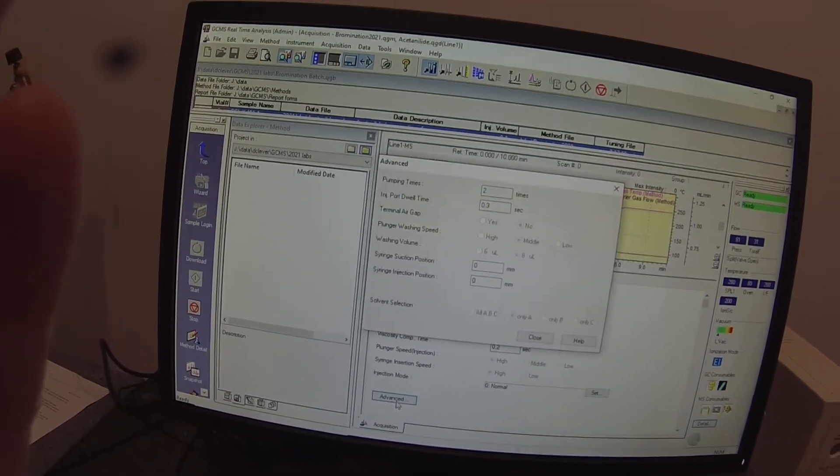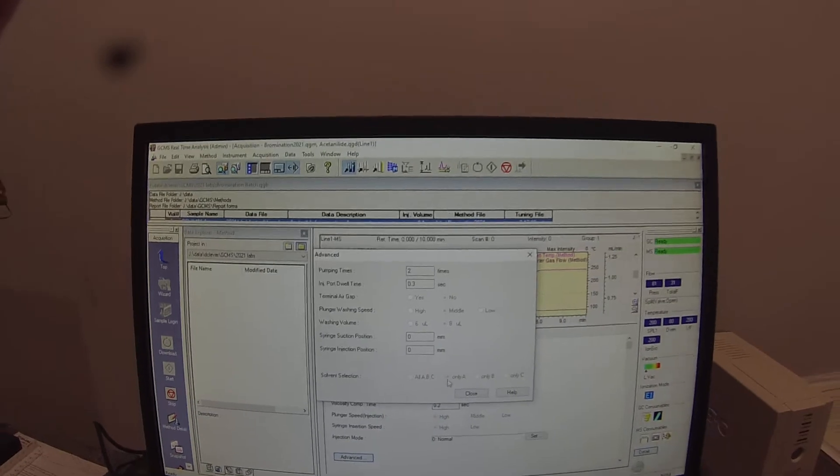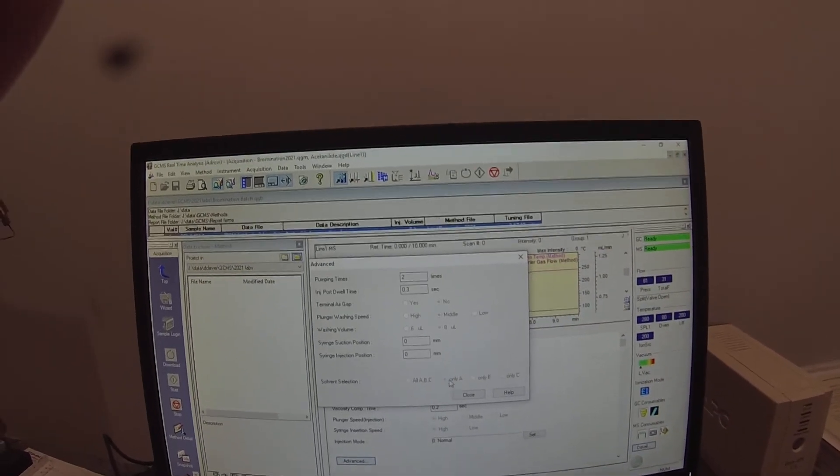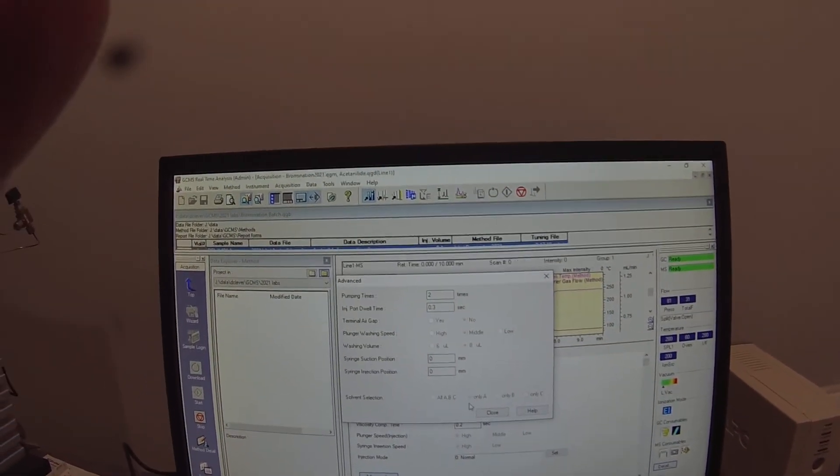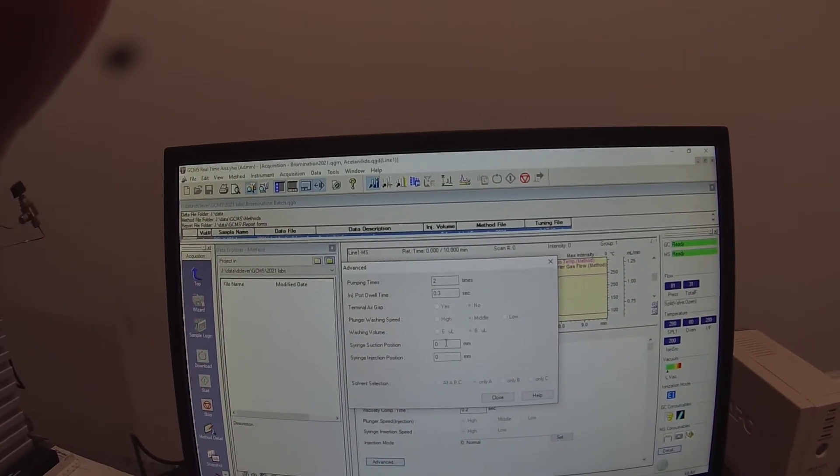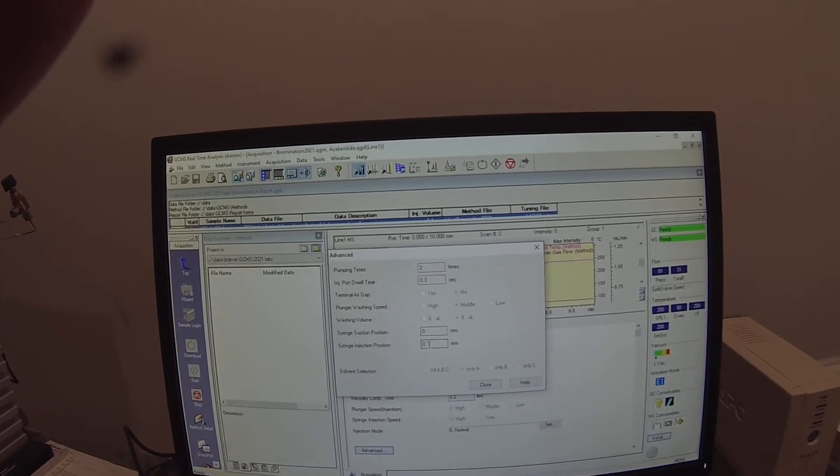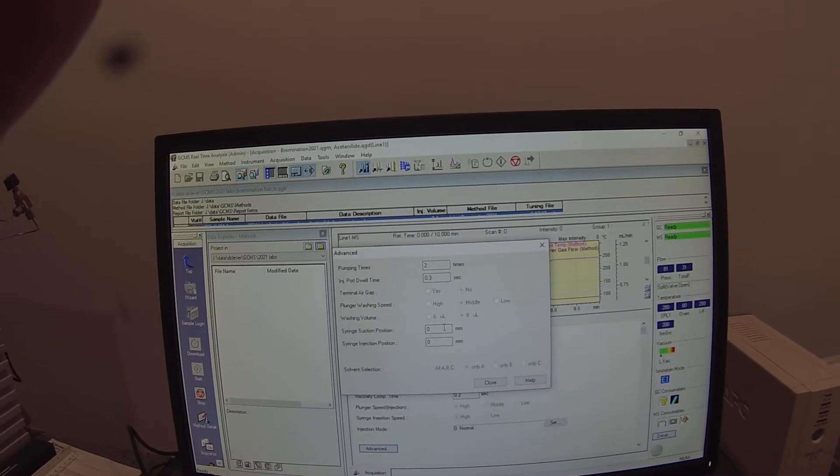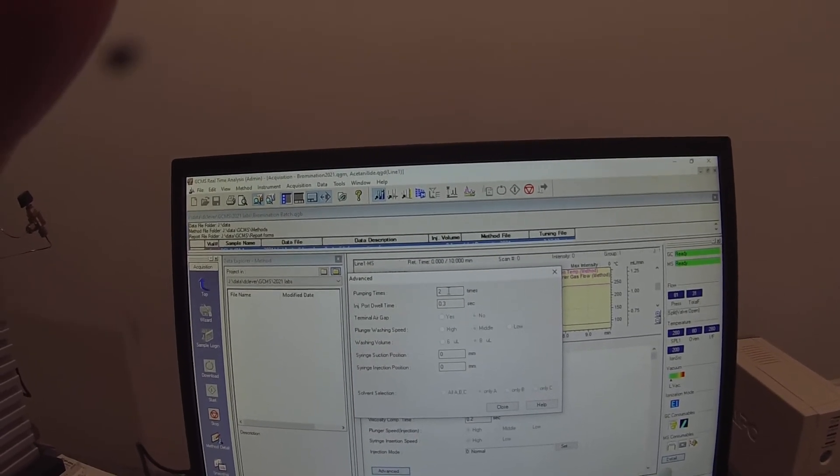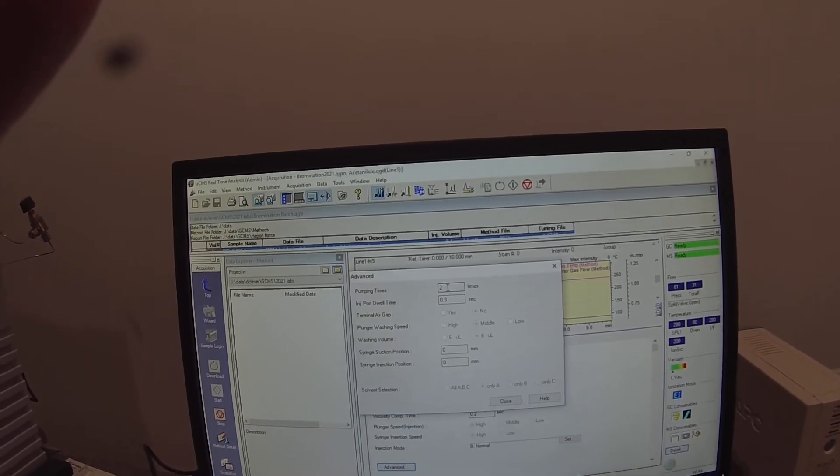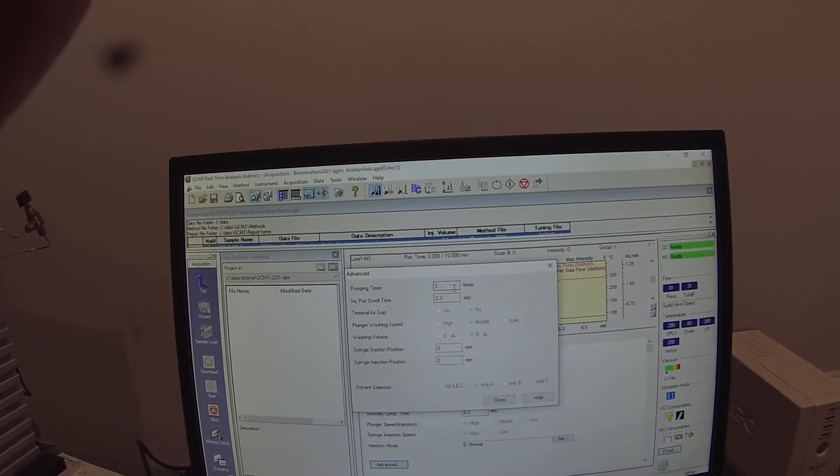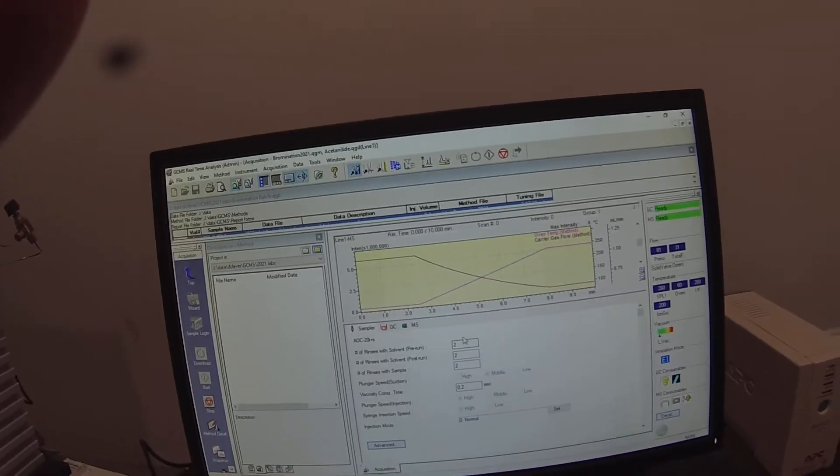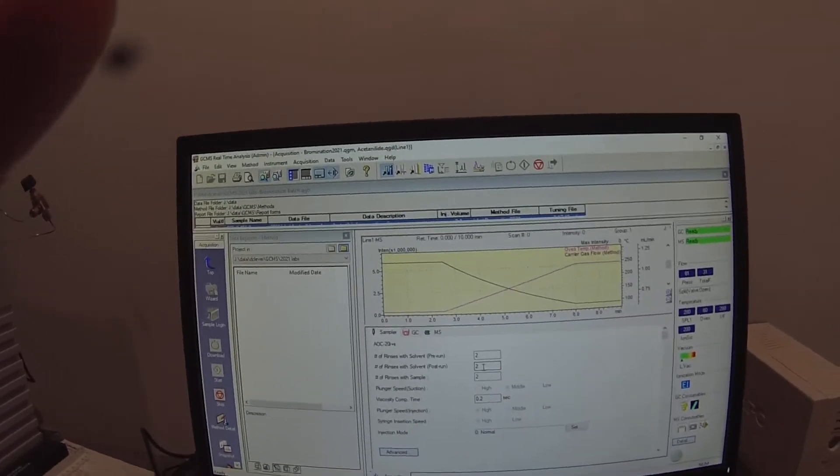And then under the advanced tab I have it washing with only A which is just the methanol. It's going to go all the way to the bottom. Syringe injection position and suction position are both at zero millimeters and it's going to pump twice to get rid of air bubbles. So everything's set at two.